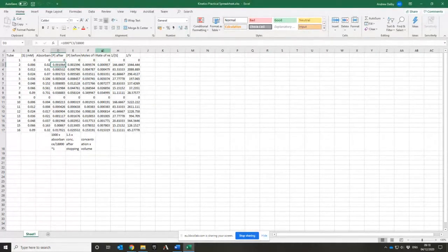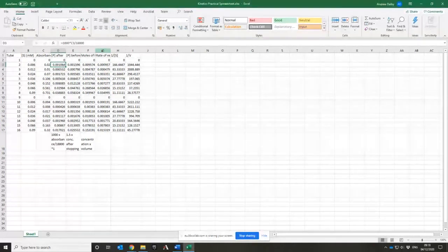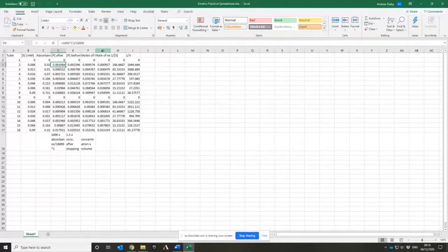If I have two changes of direction, then I end up with a cubic function. So it has to have x cubed in it. So I have ax cubed plus bx squared plus cx plus d being my constant, my regular number. You can see as I'm building up the number of terms of x and the complexity of my curve, I build up the number of things I need to fit my model.